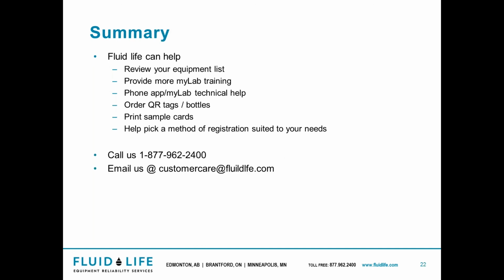So in summary, Fluid Life, we can help you review your equipment list, provide more myLab training, help if you need technical help with the phone app or myLab, ordering QR tags and bottles, printing sample cards, or helping to pick a method of registration that's best suited to your needs. We can help you with all that. And here's some contact information you can reach out to us at.